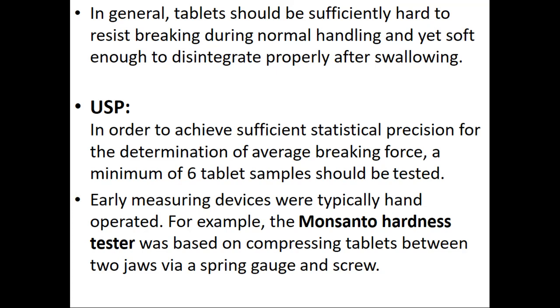In order to achieve sufficient statistical precision for the determination of average breaking force, we should test a minimum of 6 tablet samples. We take 6 tablets from the batch randomly.